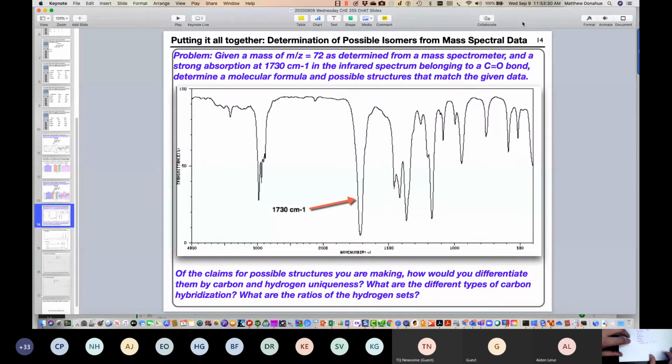So when you're proposing structures, we can sort of do something like this, right? C4H8O. We know that from our calculations it has 1 degree of unsaturation. We already know that CO, the carbonyl fragment, has to be in there from the IR. So that has 1 degree of unsaturation, right? So if we take those elements out, we have C3H8. Those have 0 degrees of unsaturation remaining.